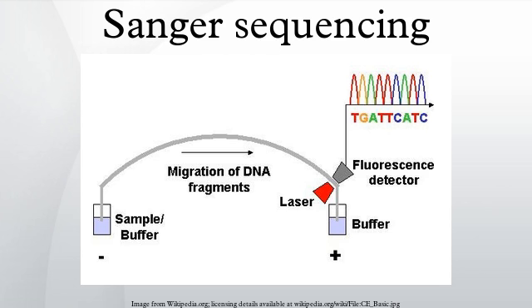After thermal cycling, the reaction mixture undergoes purification in the capture purification chamber, and then is injected into the capillary electrophoresis chamber. The CE unit consists of a 30 cm capillary which is folded into a compact switchback pattern via 65 µm wide turns.